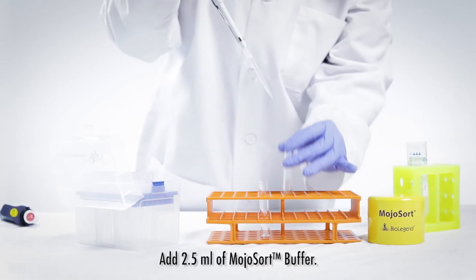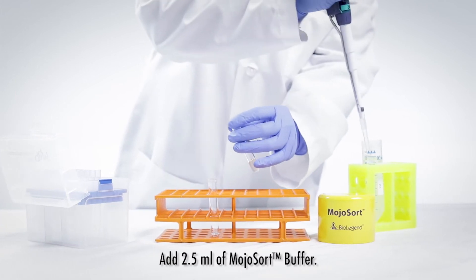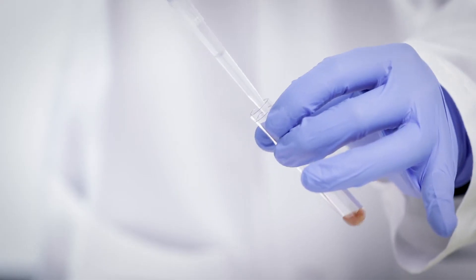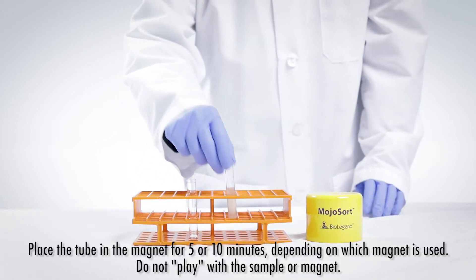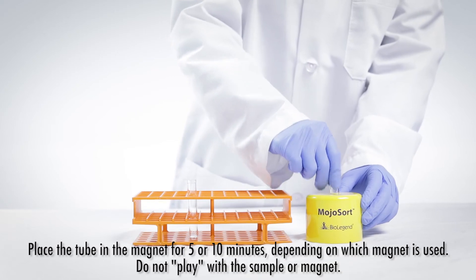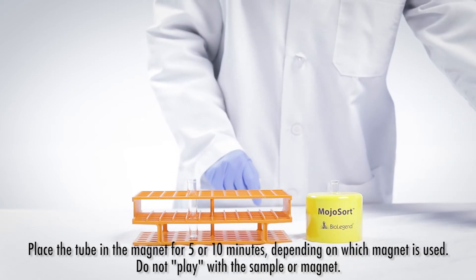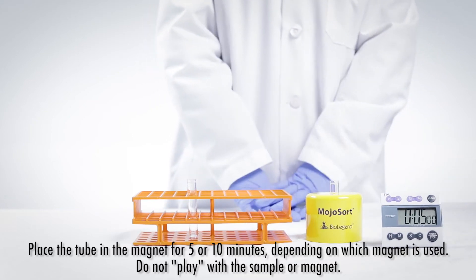Add 2.5 milliliters of MojoSort buffer, washing the walls of the tube while adding the buffer. Place the tube in the magnet for 5 minutes. If using a 14 milliliter magnet, incubate for 10 minutes. Do not twist or play with the tube while it is in the magnet.